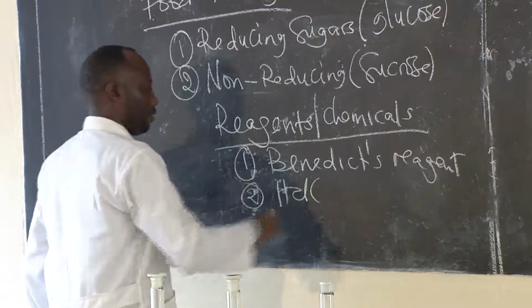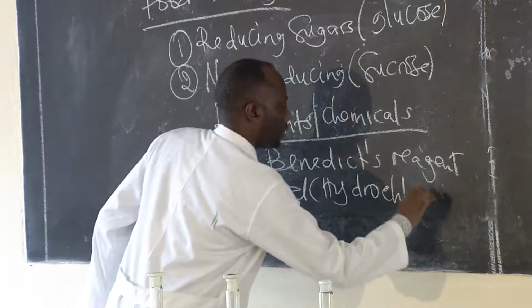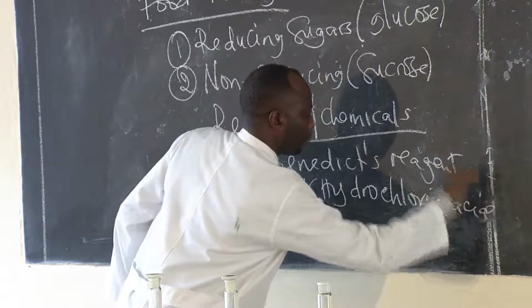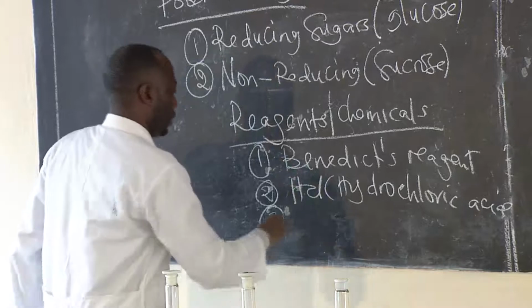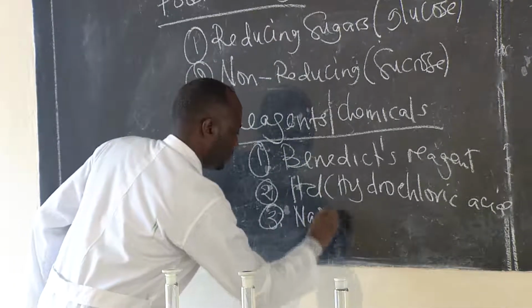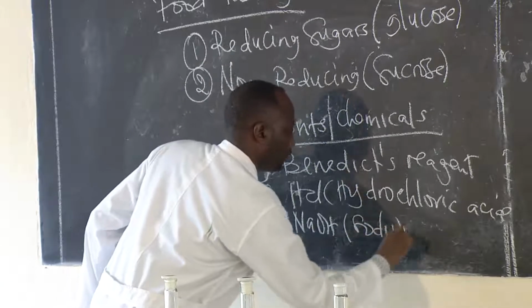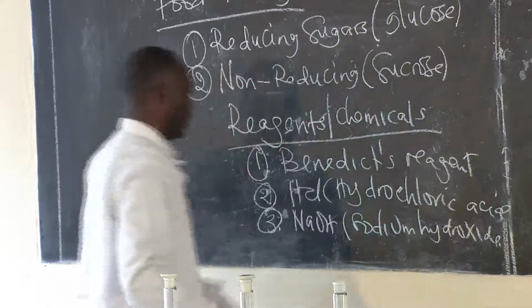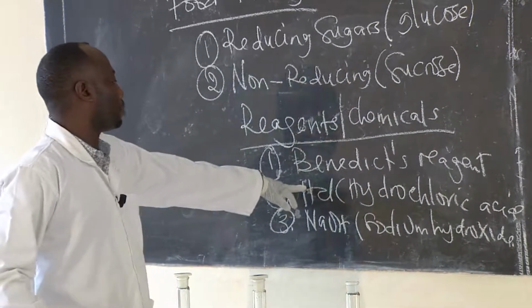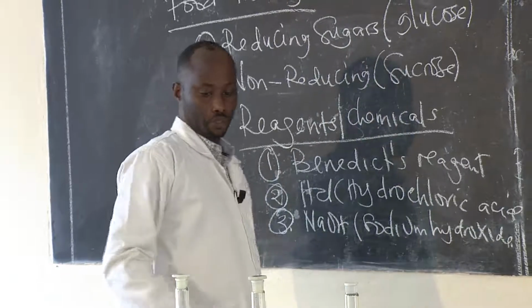That is the symbol of hydrochloric acid. I will also use 3, sodium hydroxide. You know the reason why I have to use hydrochloric acid and sodium hydroxide. I will explain it in the process.